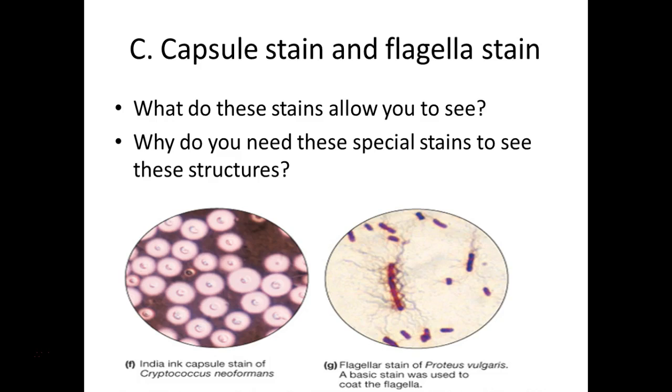So again, imagine on our body, our hairs, how thin they are in comparison to our whole body. So now a bacteria, you're trying to see basically his little hairs. Well, you're having trouble enough seeing him, never mind the submicroscopic hairs. Ain't gonna happen. So what we do is the stains that we use for this bind to the flagella.